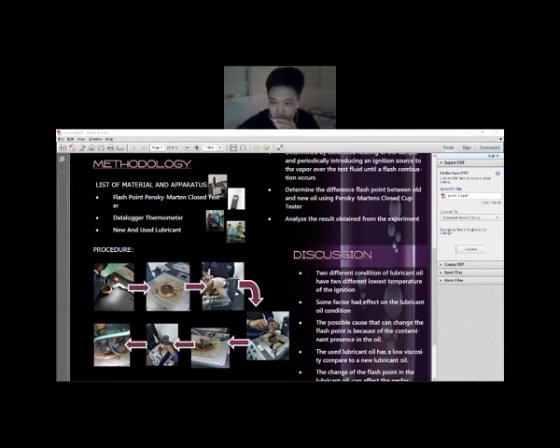Firstly, we pour the used lubricating oil into the test cup. The temperature of the test cup and the test specimen is measured at least 18 degrees Celsius below the expected flash point. Why do we use the used lubricating oil first?